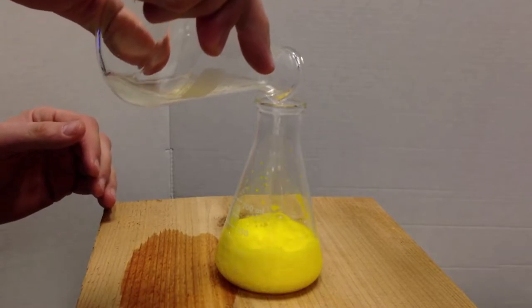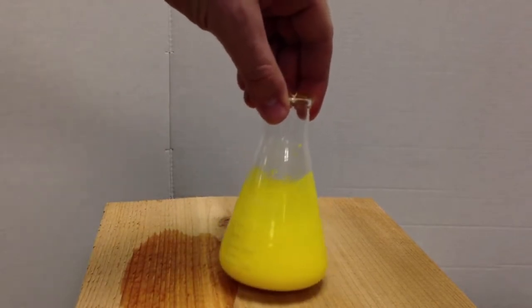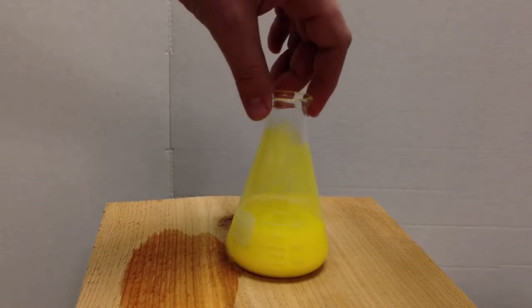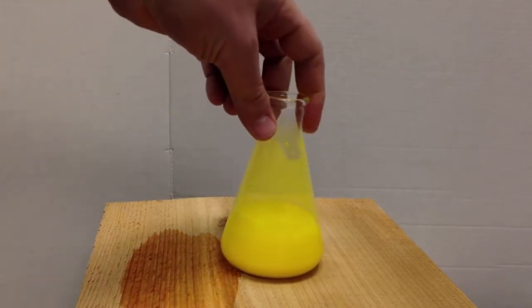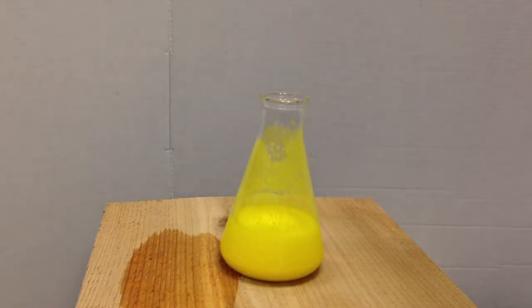Very brilliant reaction. And you see that is a very pretty yellow precipitate. A lot of yellow leads, lead paints, have been known to be yellow and also a problem. So there you go, and there's your precipitate. And it's a precipitate because I cannot see through the solution anymore. And if we let this settle for a while, we'll get something like this.